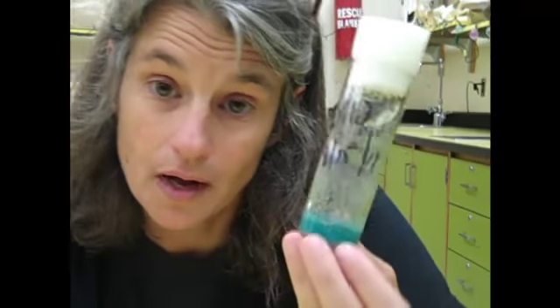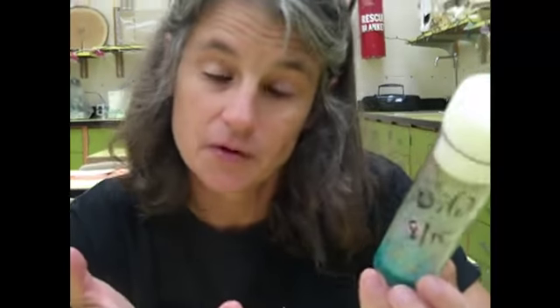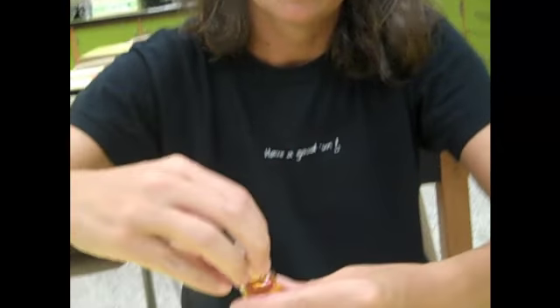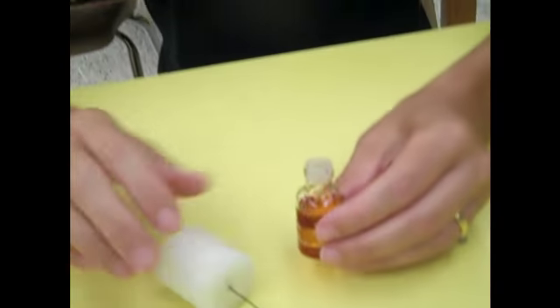Now, these are normal, what are called wild type flies. These have all the normal characteristics of fruit flies, and that's what we'll be working with first. And before we can work with fruit flies, the first thing we have to do is put them to sleep. So there is a chemical, and you all will work with this. It's called fly nap.